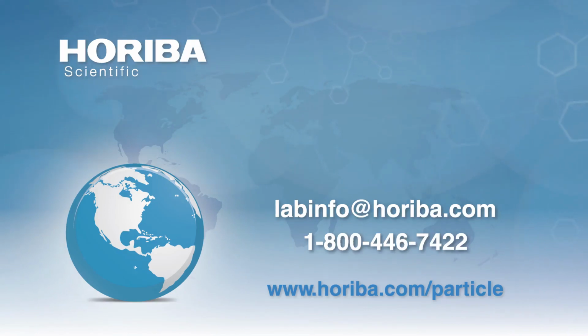Now, this question came specifically from the registration. Can it, meaning the ViewSizer 3000 nanoparticle tracking analysis, measure small to intermediate peptide to peptide non-covalent complexes? No. And so, all right, yeah.